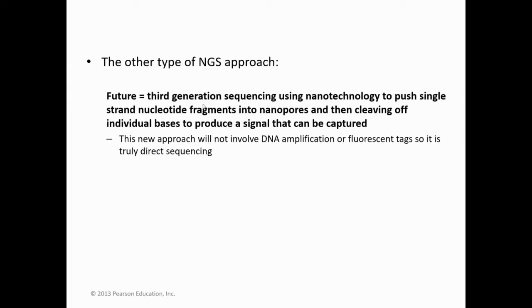technology, especially like a year ago when the pandemic started, and it's very powerful, so that scientists can use the NGS technology to determine the SARS-CoV-2 virus genome sequence.